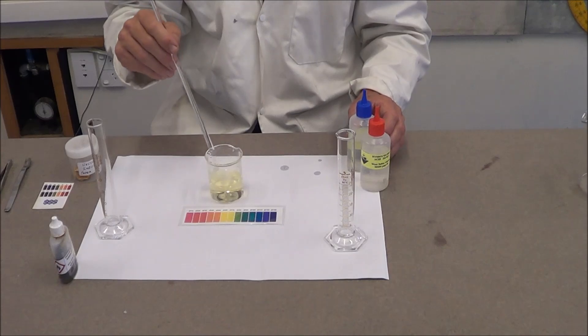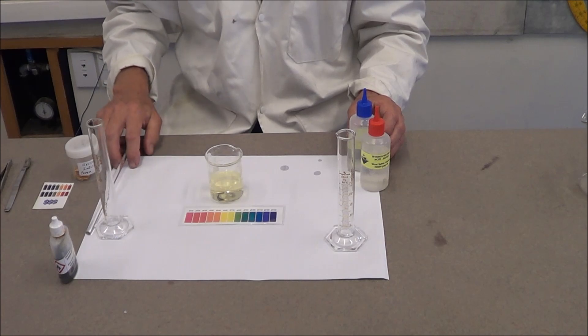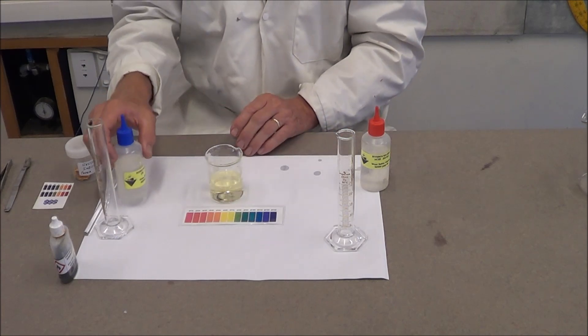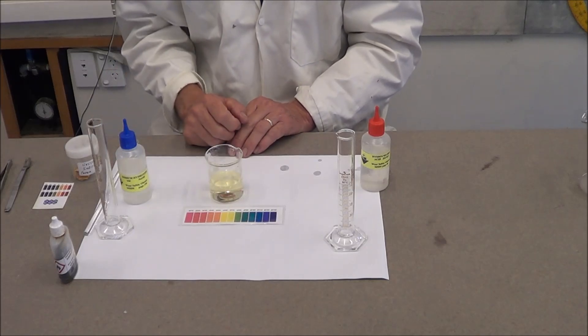And there we have our universal indicator color indicating the pH of 7. The acid should all be neutralized and there should be little or no leftover alkali in that reaction mixture.